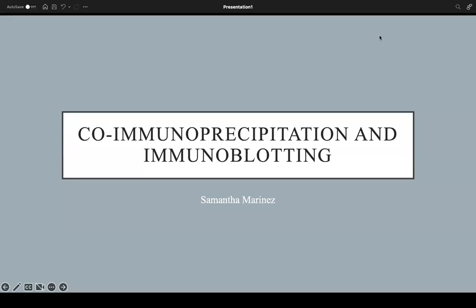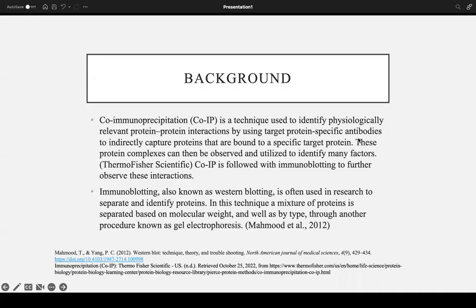So the topic I chose is co-immunoprecipitation and immunoblotting. A bit of background on both of these topics.